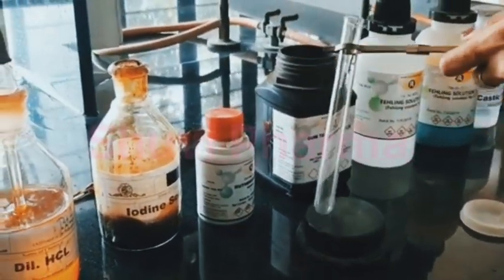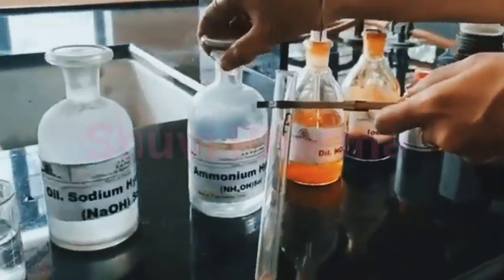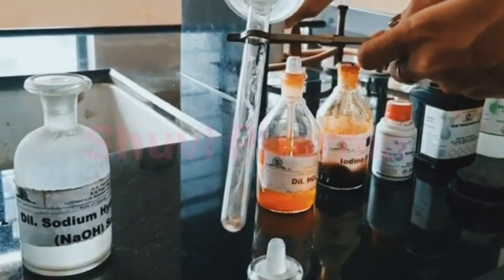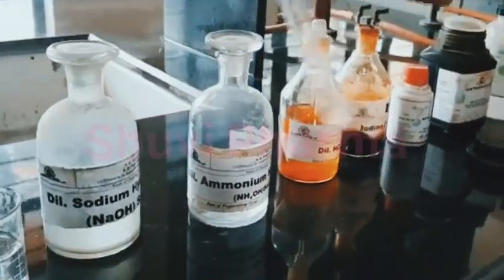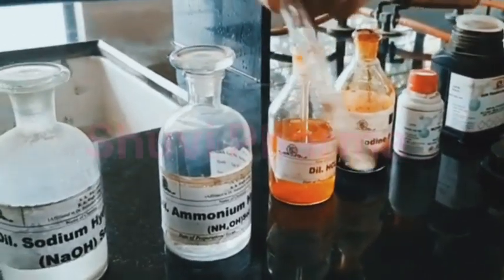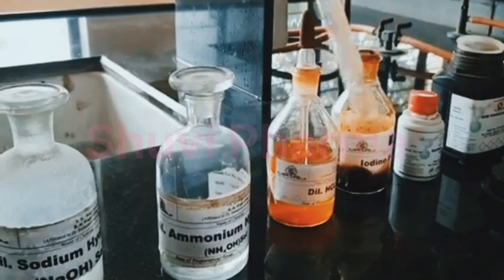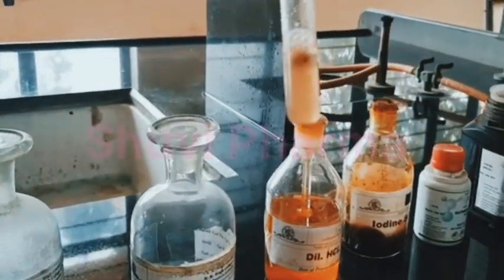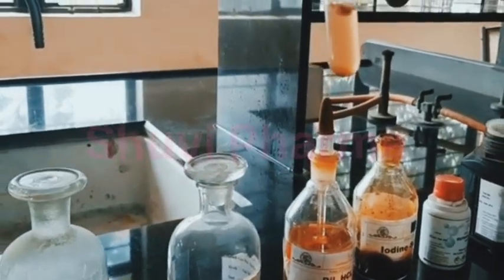The next test will require gum in the test tube. To that we'll add ammonium hydroxide solution. Here, this stringy precipitate obtained by addition of ammonium hydroxide indicates the presence of tragacanth.